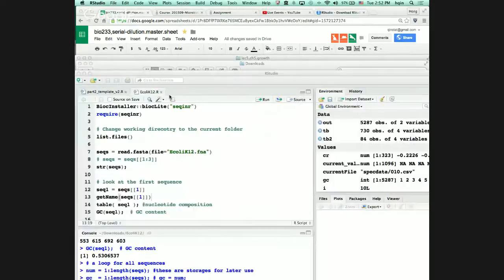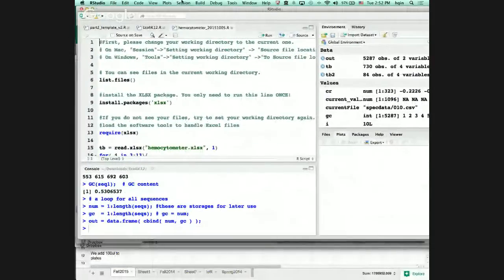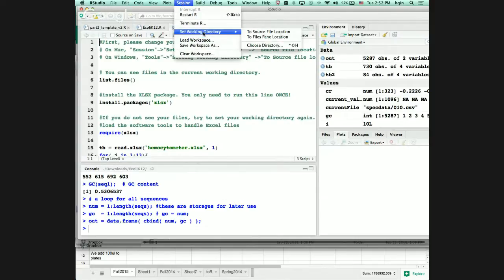The reason why I'm asking to do this is because after you put everything together, it's going to be very easy. This may look intimidating at first, but once you get the rhythm into it, you can get everything done precisely for the data analysis. I did this in Bio233. Those are just sophomore students, and many of you are already seniors, so you should be fine.